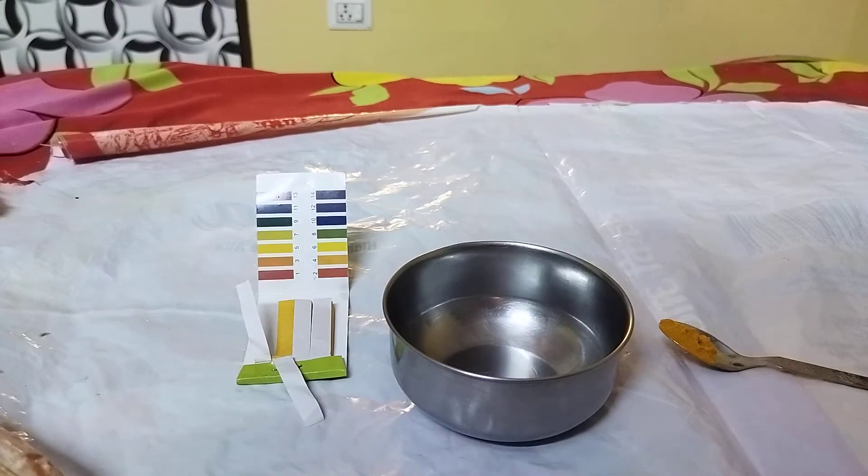Hello all, welcome to my YouTube channel. In this video, I'm going to measure the pH of turmeric powder, or Haldi as we call it in Hindi.